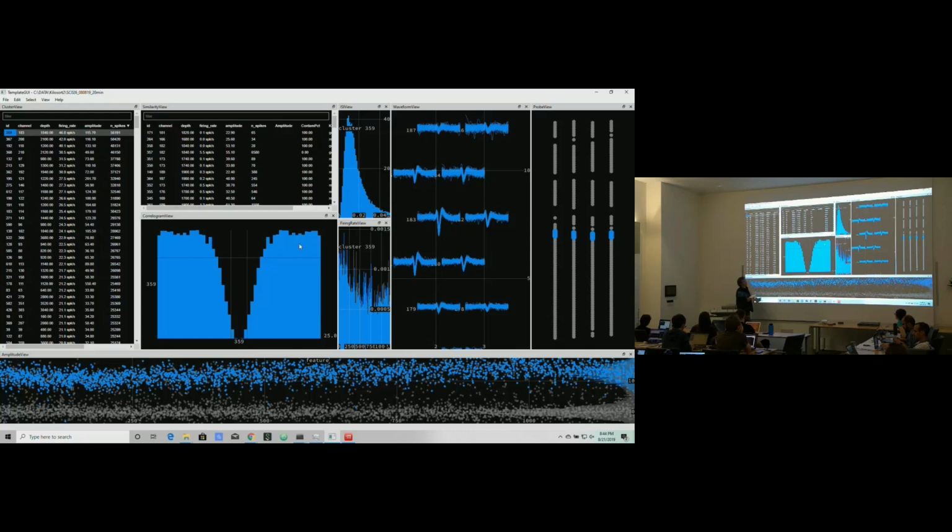So if you see beautiful things like this that collapse to 0 in the middle here, maybe there's one outlier sample here or something. Yeah, that's good. That means you have a very good refractory period neuron.